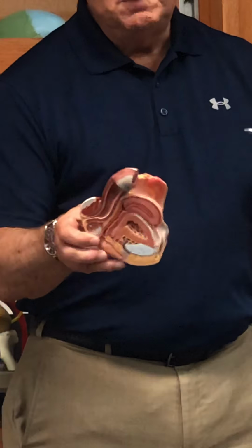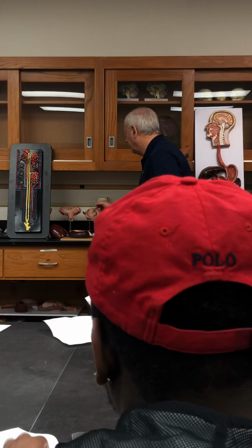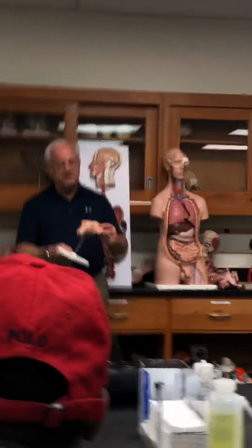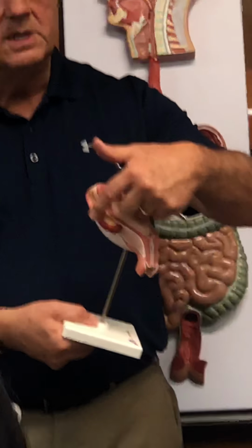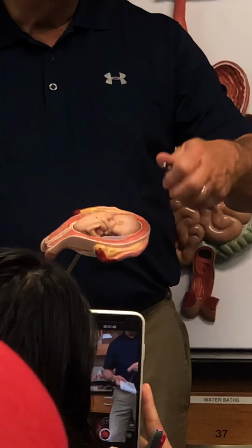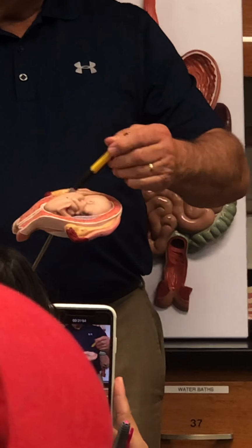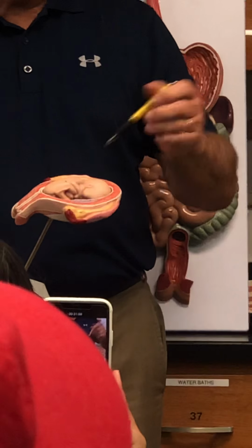Okay. Hey, that's pretty much it for the female. Or I could use some of these structures. Right? If I took a look at these, like these guys, right? If you take a look at the structures on the outside, again, you can just see tubes. These are the fallopian tubes on the outside here. This would be the ligament, the ovarian ligaments. You can see the baby is developing here, right? This would be the placenta over here on this side, right? So the baby would be in this sac. What's this sac called? Amniotic sac, and the fluid on the inside?